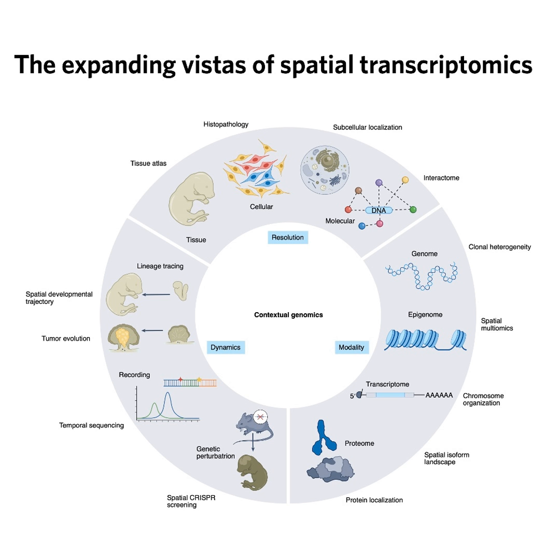Okay, let's unpack that historical dilemma a bit. On one side, you had these comprehensive omics tools, right? Like RNA sequencing. Mm-hmm. These gave you the full parts list. They could quantify every single RNA transcript in a sample, a huge amount of data. Huge amount, yeah. But, and this is the key, to do that, you had to homogenize the tissue. You basically ground it up. And in doing that, you just obliterated all the spatial context, all the where. Exactly. You knew what was present, but you had absolutely no idea where it was. Imagine having the full library of components for a car, but the assembly manual is just shredded confetti.